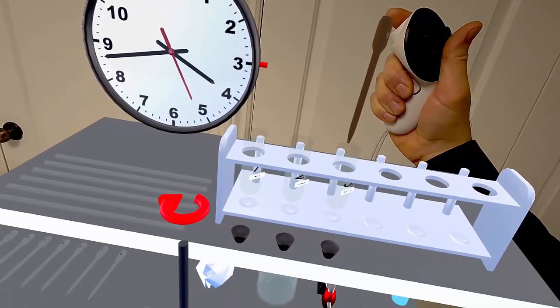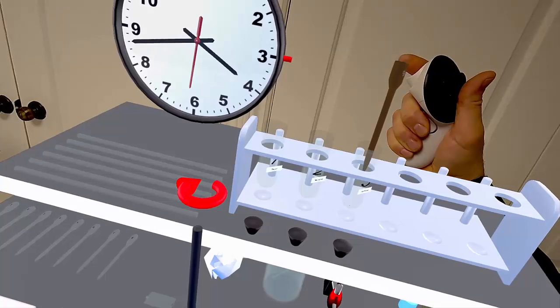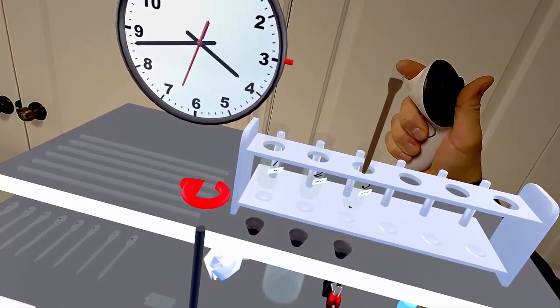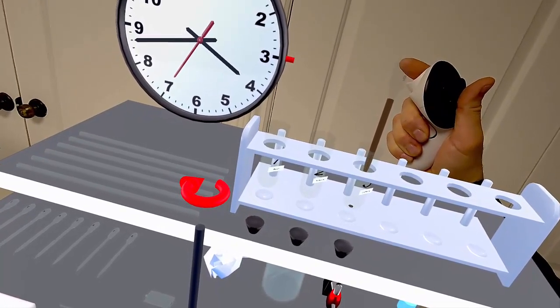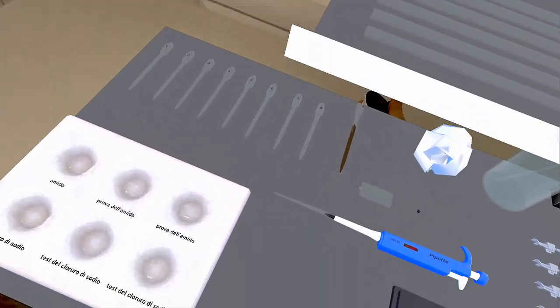Then move the dropper to the container where you want to release the liquid and press the trigger button one or more times to gradually release the contents of the dropper. You can then set down the dropper by releasing the button at the base of the controller.